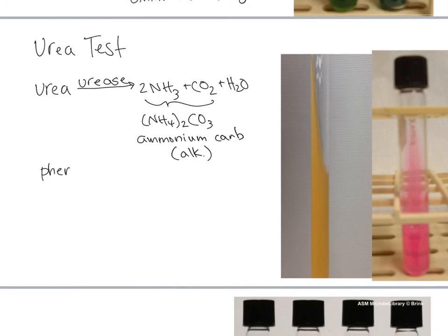Okay, so we have a pH indicator, phenol red. You're going to see that indicator again in the next lab in exercise 15. Lots of pH indicators today. I usually tell students, know the media, know the reaction that we're looking for, like the substrates, the products, the enzymes. Know that there is a pH indicator in there, but whether it's neutral red or phenol red or methyl red, I'm not so much worried about that and would not ask you that on an exam.